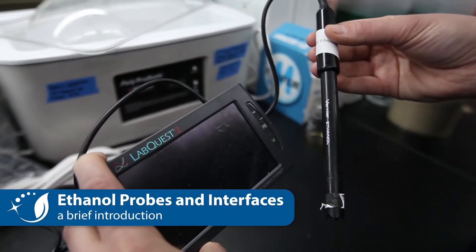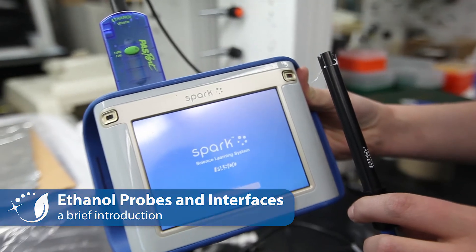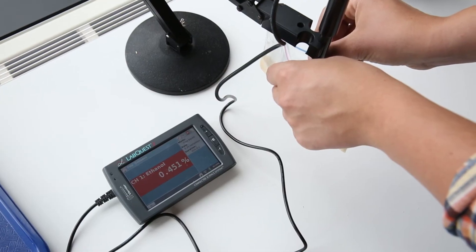Classroom grade ethanol sensors and interfaces, available from vendors like Vernier and PASCO, can be used for ethanol measurements and fermentation experiments.